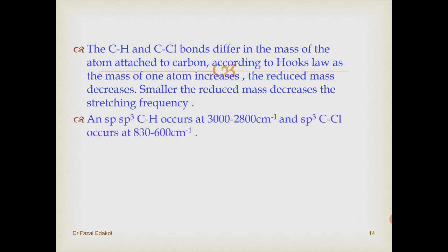An sp3 C-H bond occurs at 3000 to 2800 per centimeter, and sp3 C-Cl occurs at 830 to 600.